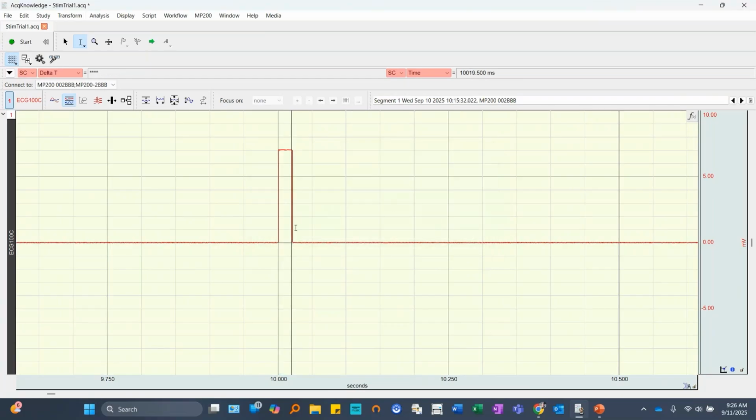Now I will say this, just because we put 7 there, and that's a 7 millivolt pulse, that does not by itself equate to 70 decibels. I'm just using that because I like that number in my head, basically. So I'm going to do 7 for the pre-pulse and 10 for the actual pulse. The actual volume of this will be controlled by the stimulator itself. And there's a volume knob on the stimulator. So once we have this created, we would need to utilize an auditory decibel monitor and figure out where the volume control needs to be to get things dialed in terms of the volume.